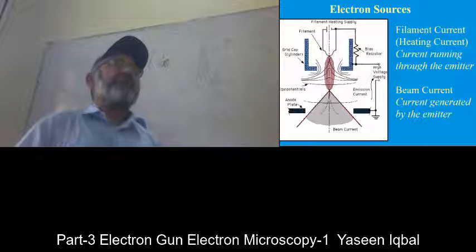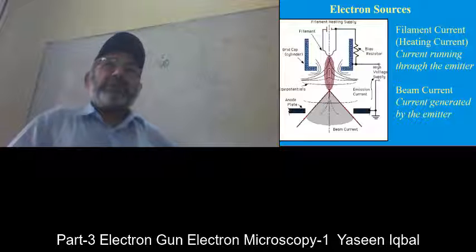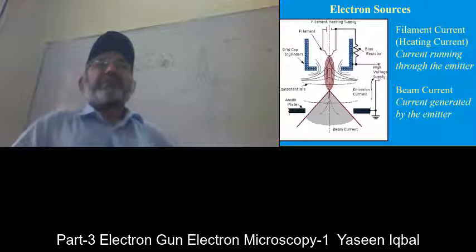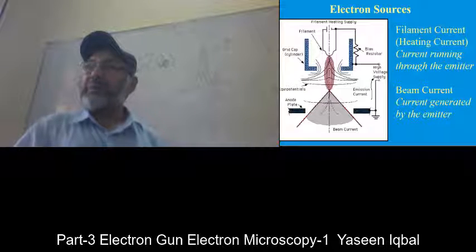Sometimes people talk of dark field electron microscopy. Dark field electron microscopy is done for the features that are not visible in bright field microscopy.